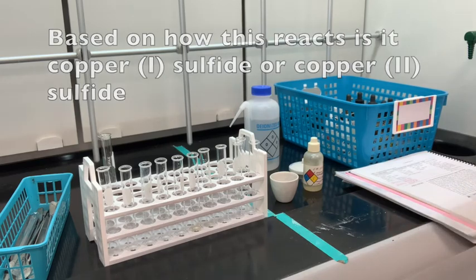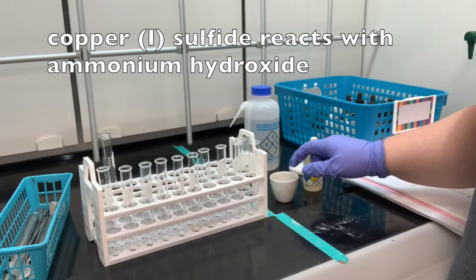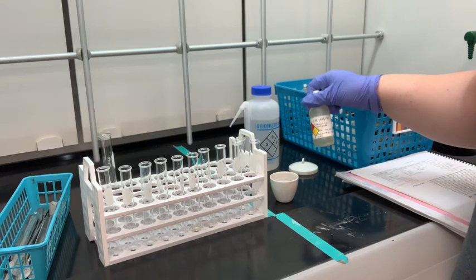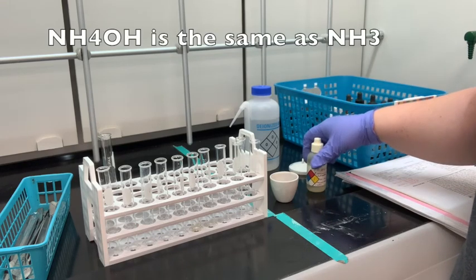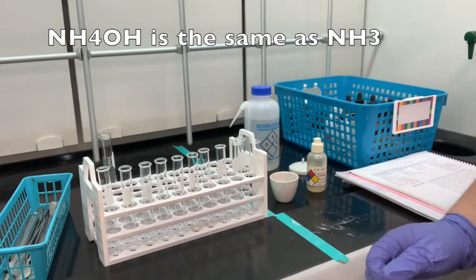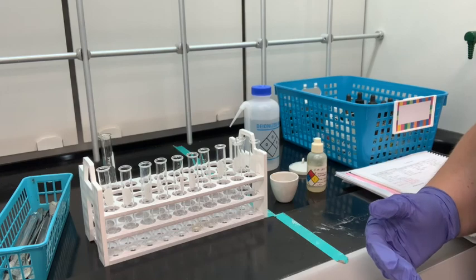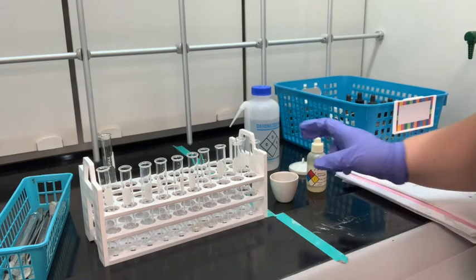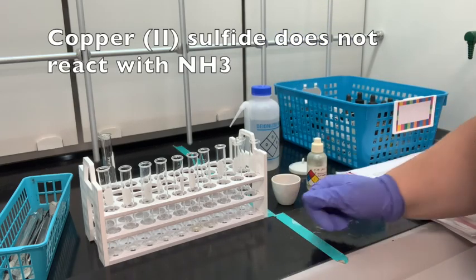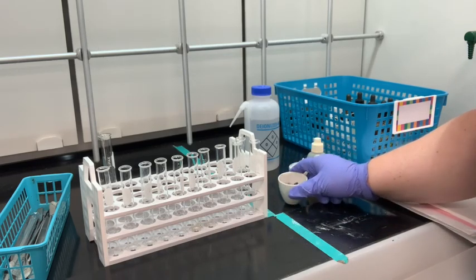Copper 1 sulfide reacts with ammonia. So what we're going to do is take some of our copper sulfide from this crucible, add it to a test tube, and then add some 6 molar ammonium hydroxide, or ammonia. Those are the same things. If it reacts and turns into a blue solution, we will know that what we made in the chemical formulas lab was copper 1 sulfide. If this copper sulfide does not react and just sits there in the solution of ammonia, we'll know that the copper sulfide is the copper 2 sulfide compound.